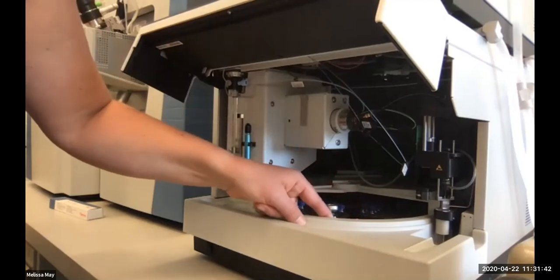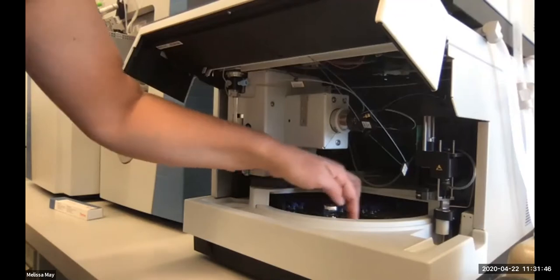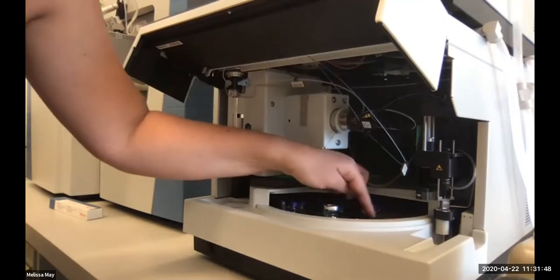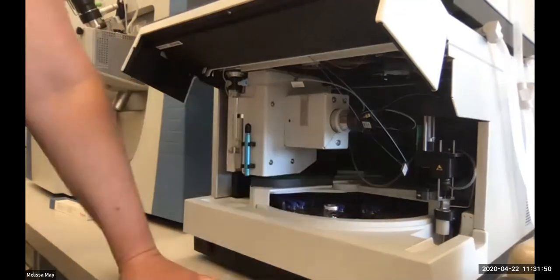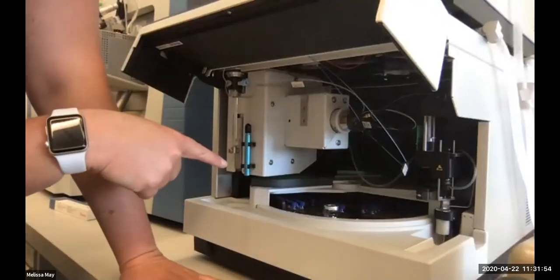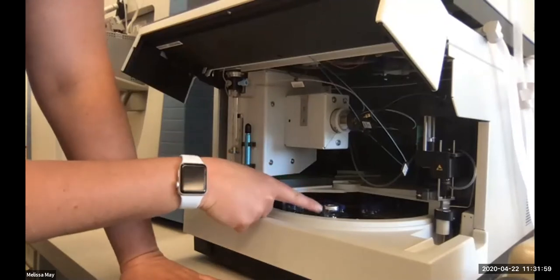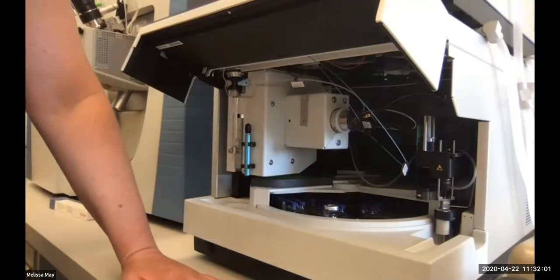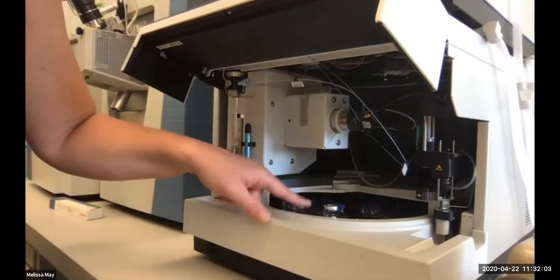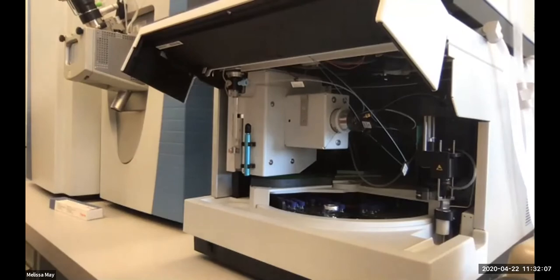These vials have different positions. If you could see in here, there are 5 different holes. Each one has a number on it, and it's associated with the color of the tray that's in the back. So this one is in position R1. When we're setting up our methods, we tell the instrument that that vial is there so that it can pick up sample and load it onto the column.